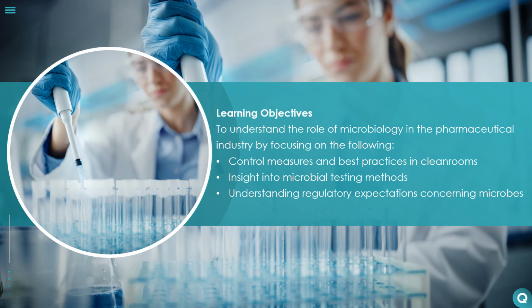Learning objectives for this session will cover learning about control measures and best practices in clean rooms, getting insights into microbial test methods, and understanding regulatory expectations concerning microbes.